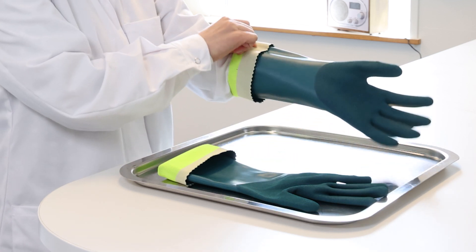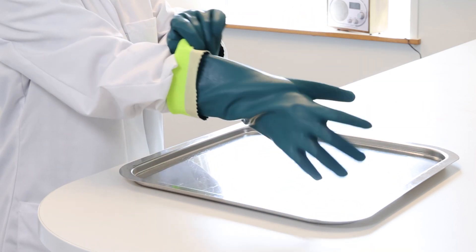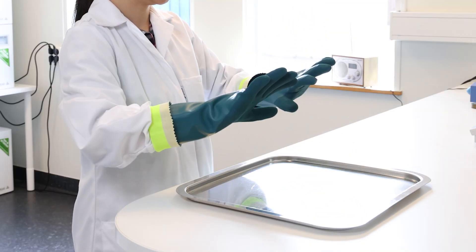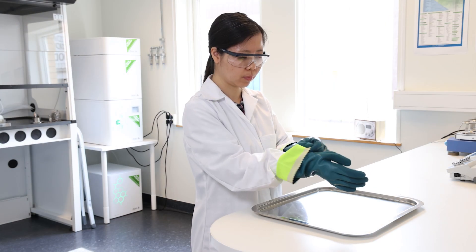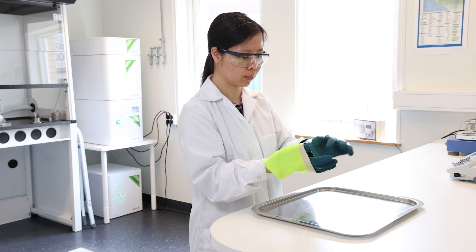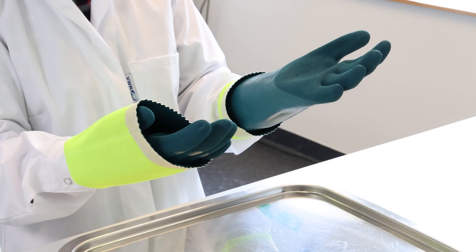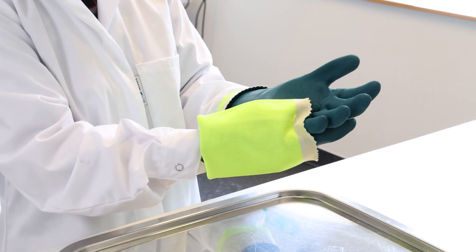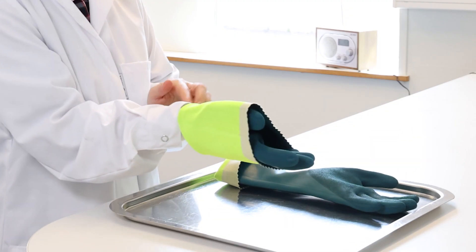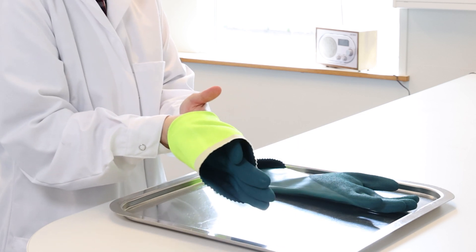Put on the chemical protection glove like any other glove. The important moment is when you take the glove off — roll it off from the bottom edge forward. Dangerous chemicals end up inside the glove. Remember that a used glove is chemically contaminated and there is a risk that the skin will be exposed to harmful substances when it's handled.